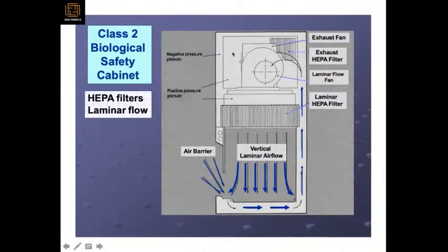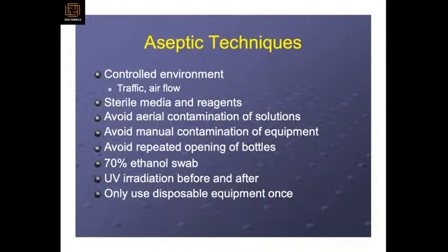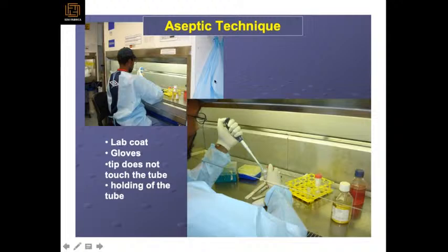And that's the biological safety cabinet too, with the HEPA filters and laminar airflow, with the vertical laminar airflow going inside there and then going up through the filter like this and then this way. Humans shed particles of skin, bacteria, fungi, etc. all the time, even sitting or standing with no movement. So aseptic techniques, UV light, 70% ethanol, avoid repeated opening of bottles outside, manual contamination of equipment, aerial contamination. So use a lab coat, gloves, and make sure the tip does not touch the tube, holding the tube also.